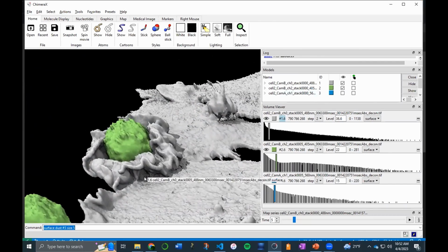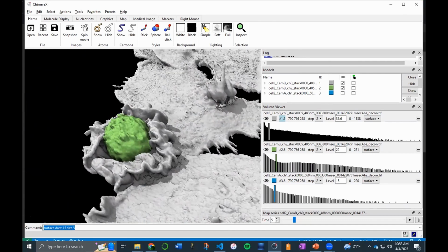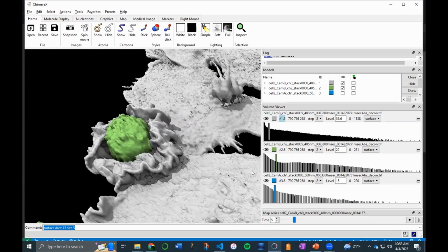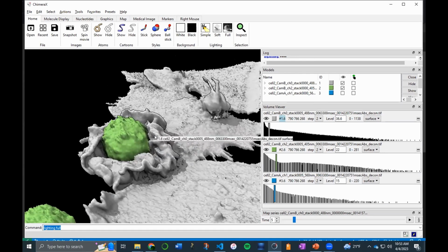If this looks very clean, and we have these nice shadowing. The beauty of it being in the crystallography realm for molecules is they've done an amazing job in terms of making the ray tracing and the lighting and everything make the data pop out. With that shadowing, you really get a sense of this ruffle coming out. Whereas if we made the lighting flat, that completely goes away. So you have full control over the way the data are presented.